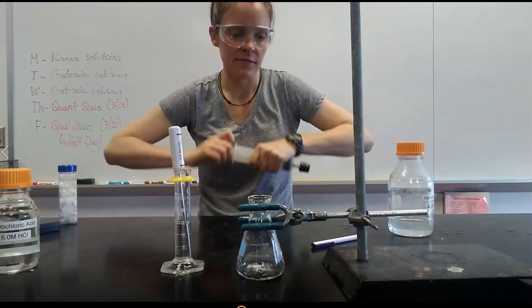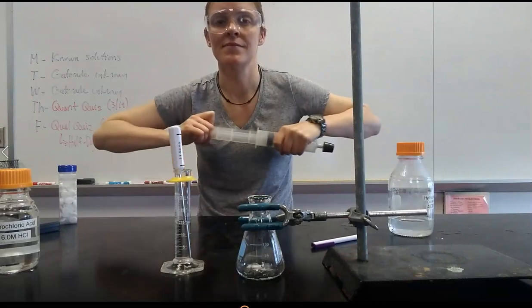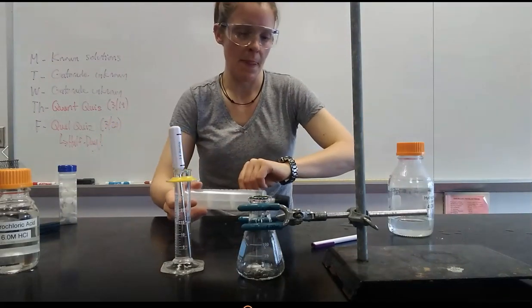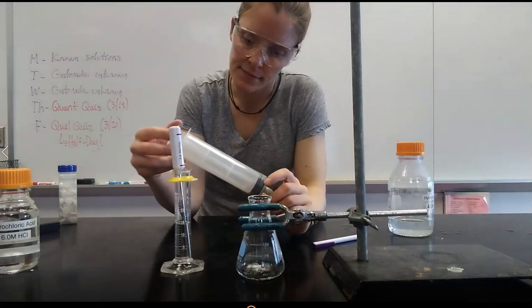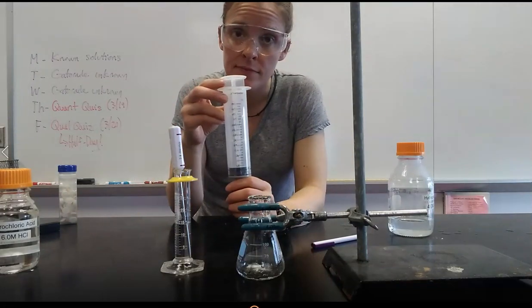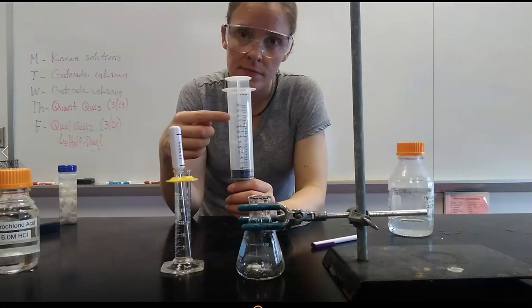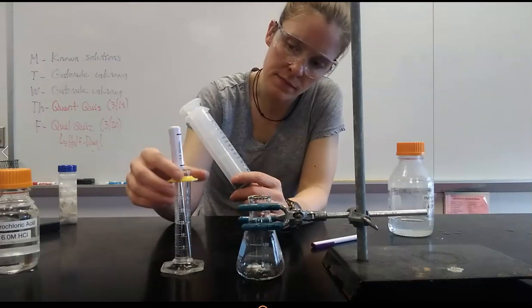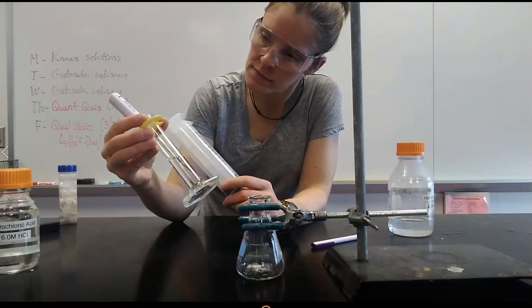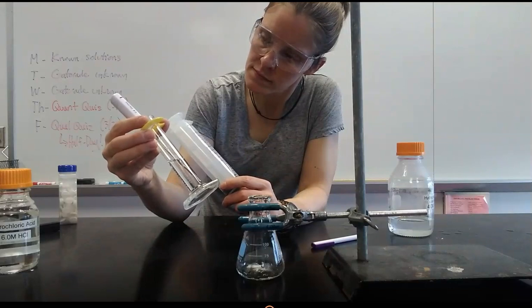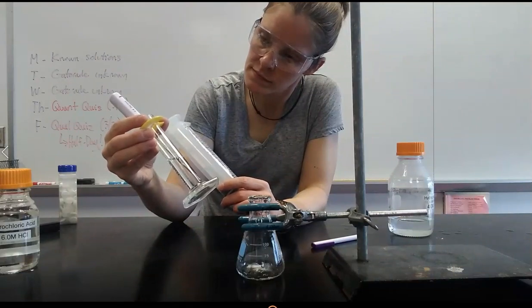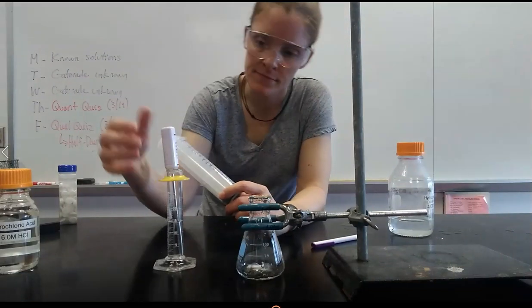When you get your syringe, move the plunger a couple of times. Make sure that it's sliding pretty easily. You can see that it is marked off every 10 milliliters. So when you go to measure with this instrument, if it only measures to the tens place, what place should you estimate to? Hopefully you're thinking the ones.